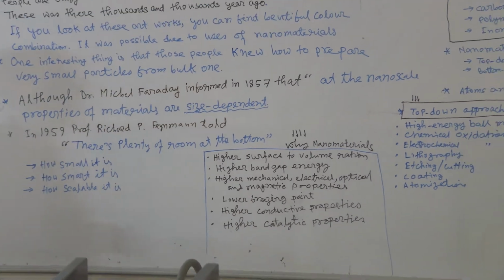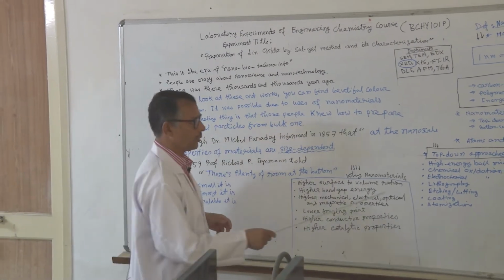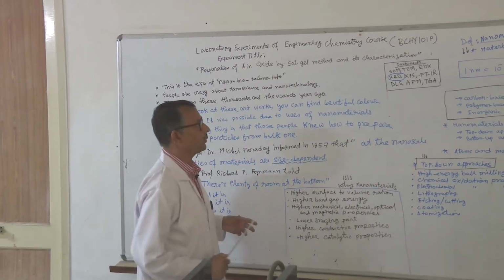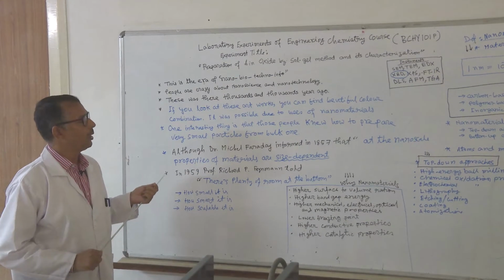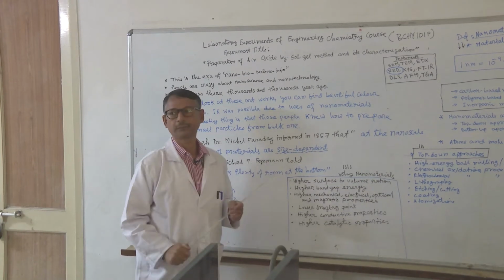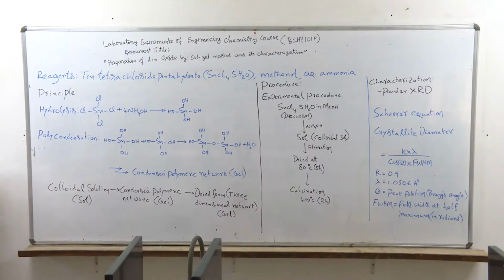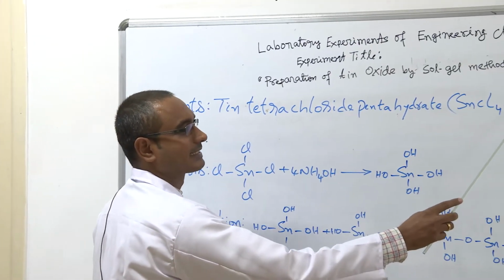Today, Professor Ramesh will discuss sol-gel methods, how to use the sol-gel method to prepare tin oxide nanomaterials and its characterization by XRD, X-ray crystallography. Preparation of tin oxide by sol-gel method and its characterization.